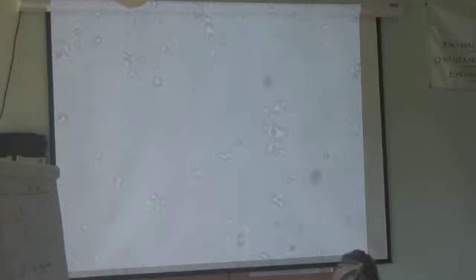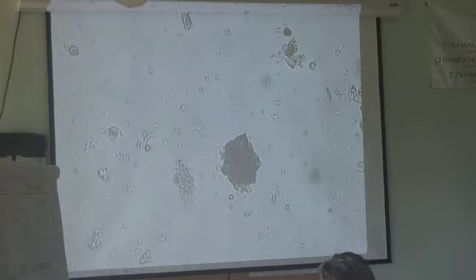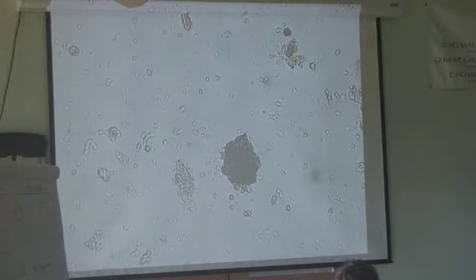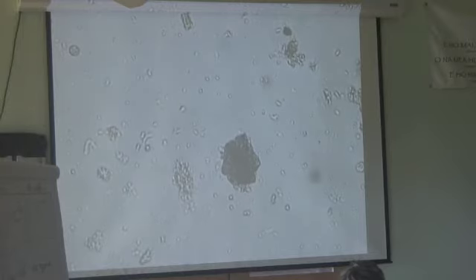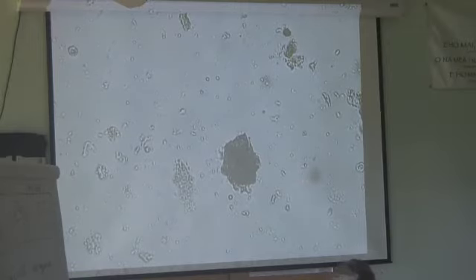And bacteria. Look at that. See any actinos? Nothing but bacteria in here, right? So this is really not real exciting. There's a lactobacillus right there. Long and narrow and kind of stiff. It's not curved, so that would be a lactobacillus. But there are lactobacillus species that are much longer. You can have lactobacillus species that would go from the edge of this through to about there. Oh look, there's another lactobacillus.